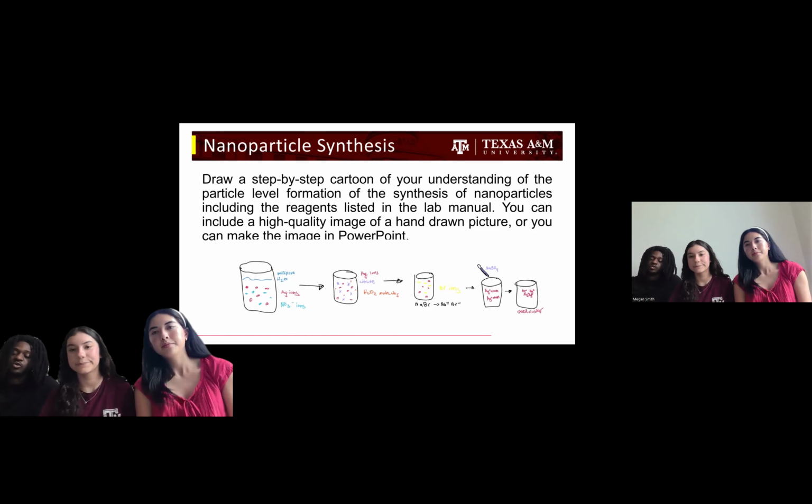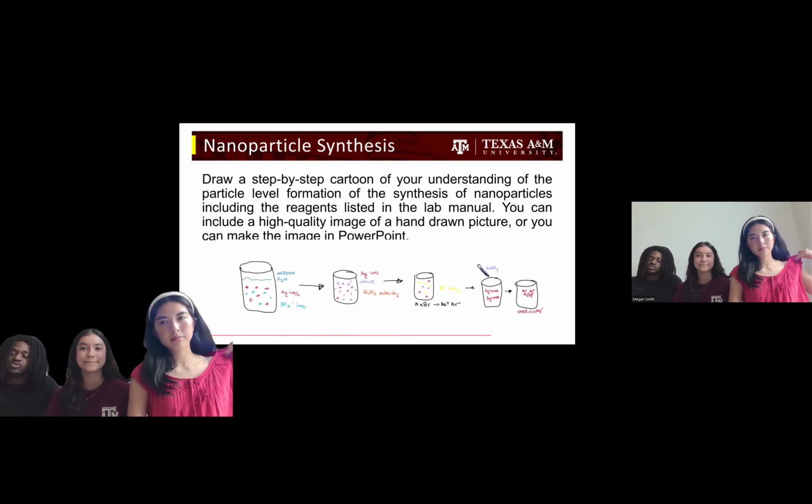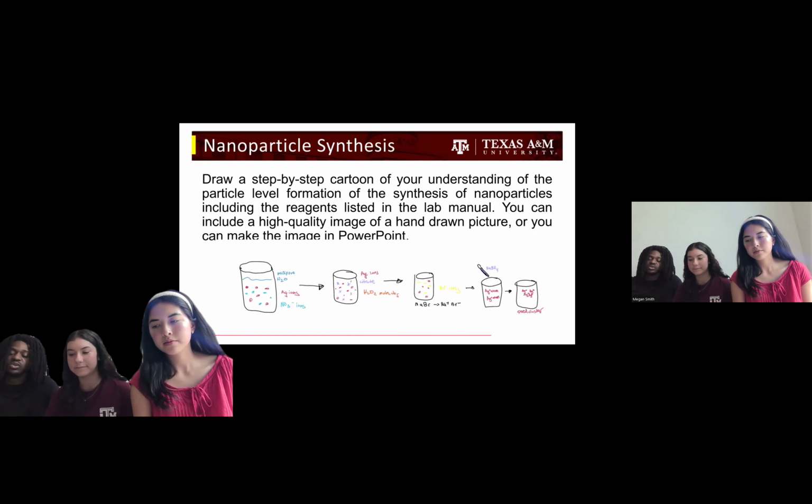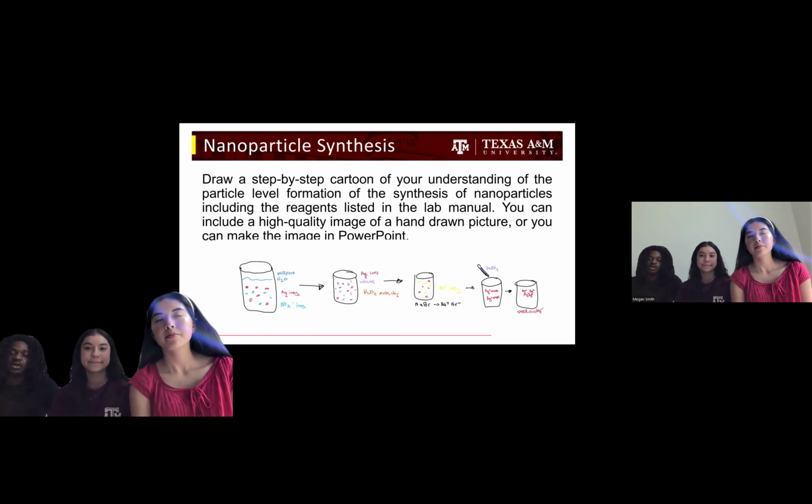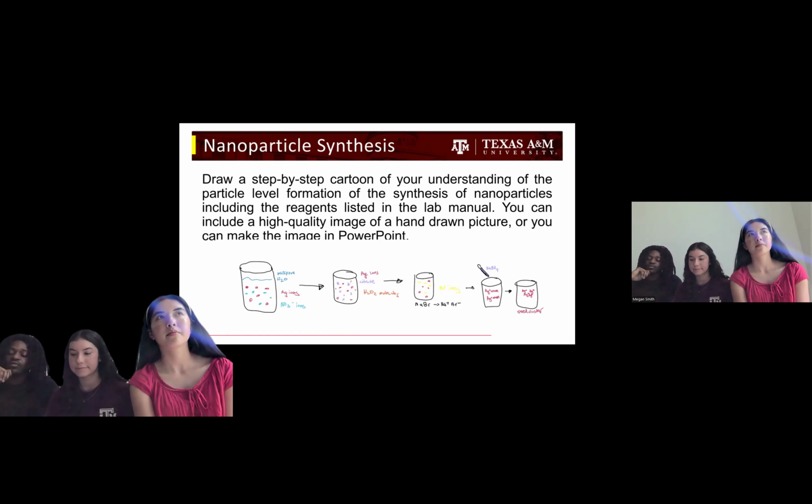Other reagents help control the final shape and size. Some of these reagents are sodium citrate, which will stabilize the particles and prevent clumping. We have hydrogen peroxide as well, which can reshape the particles by oxidizing the edges. And sodium bromide, another influential one, which can affect growth direction and help form triangular or prismatic shapes. The balance of these reagents determines the final color and optical properties of the nanoparticles.